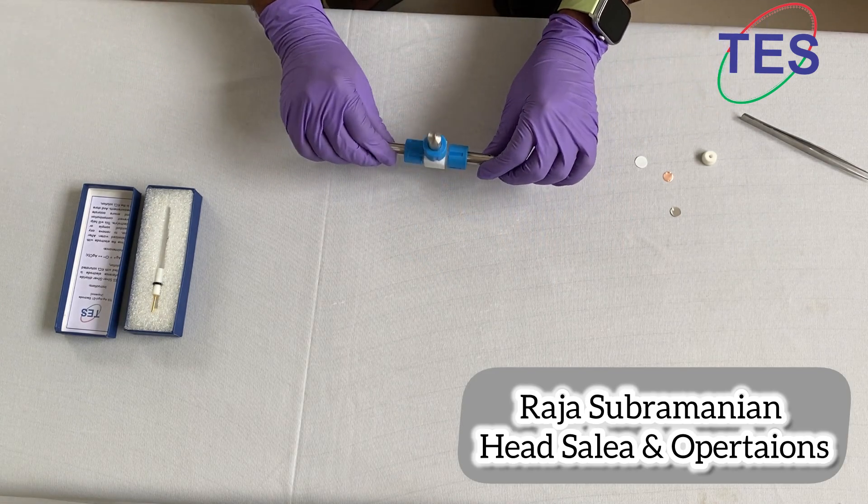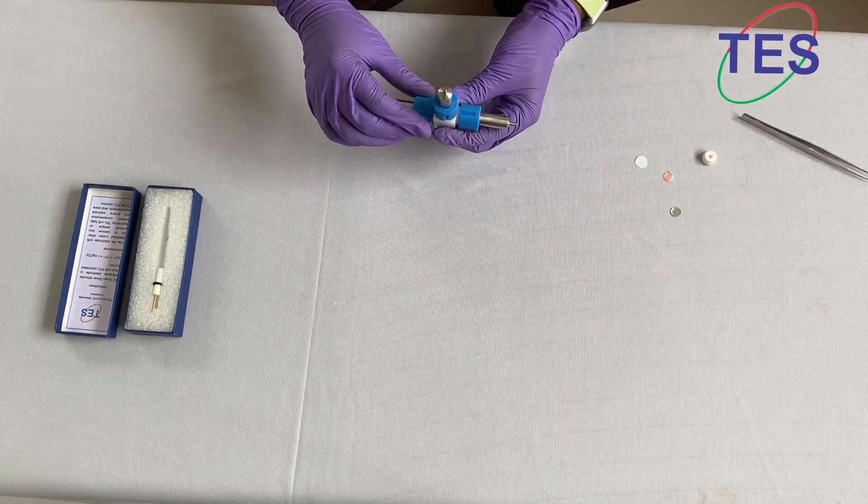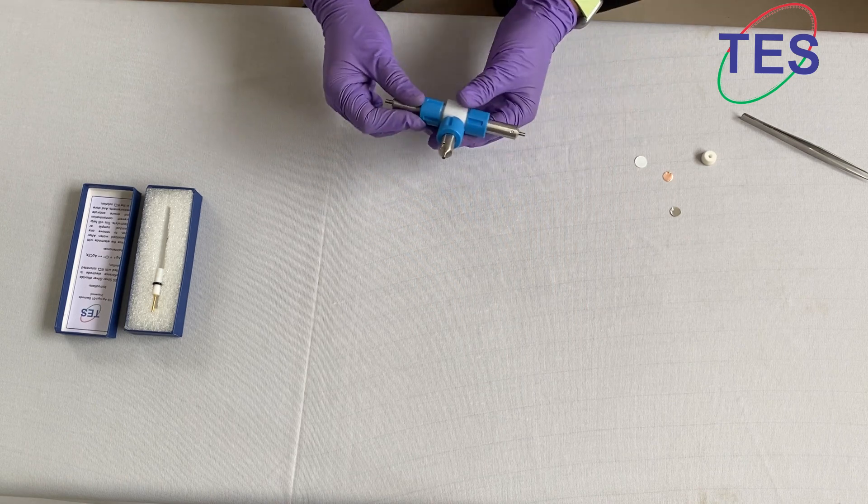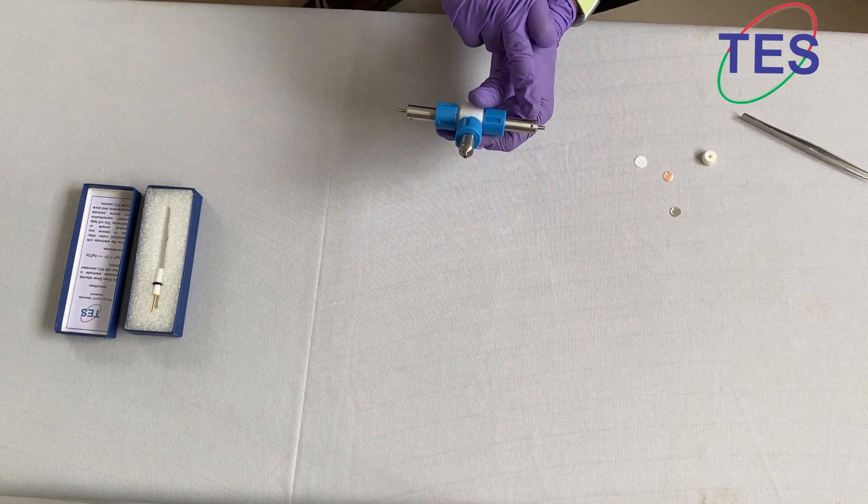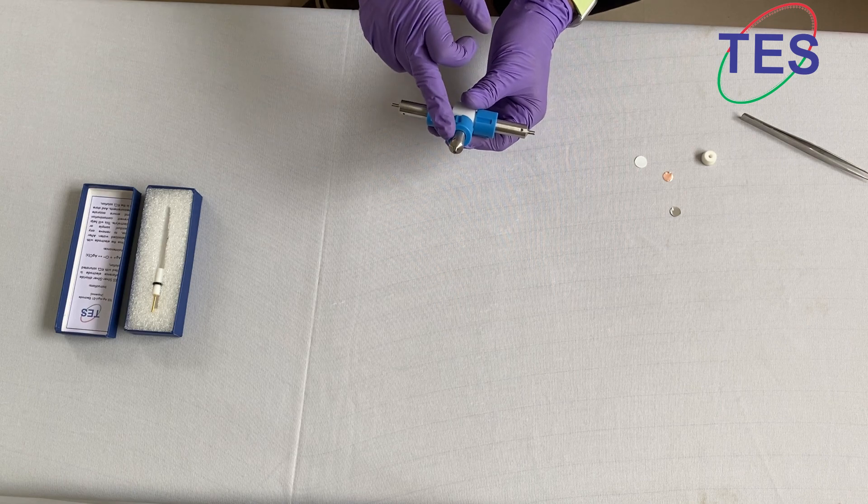Now we are going to see T-shape Swagelok type cells assembly and disassembly. This is your working electrode, this is your counter electrode, and this is your reference electrode.